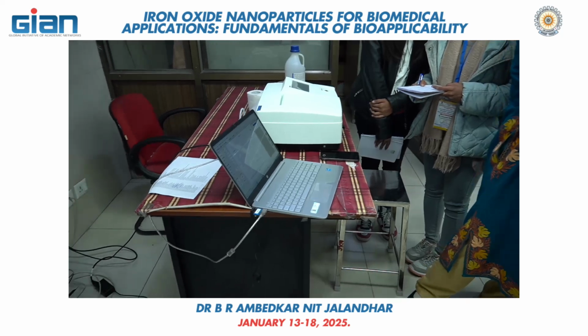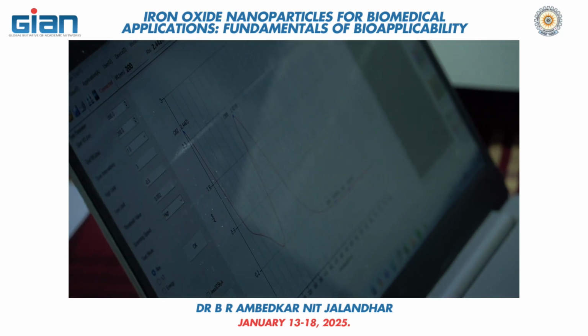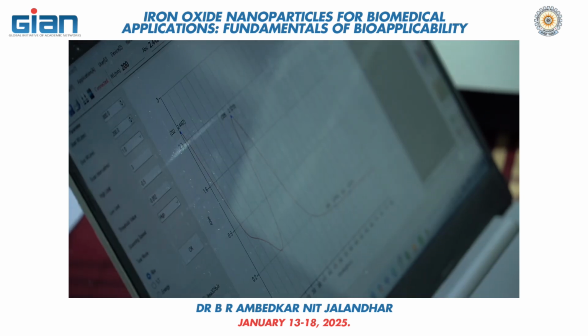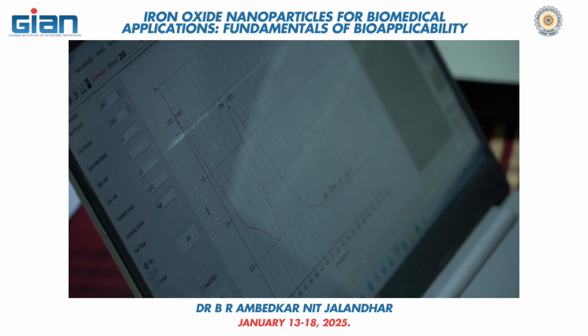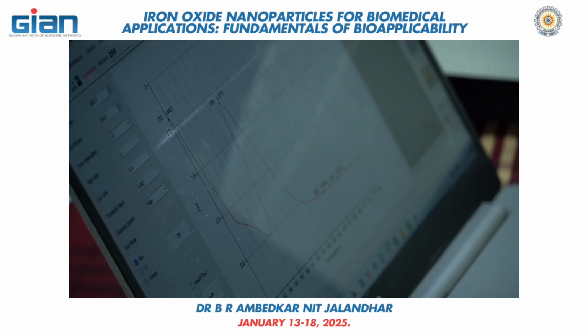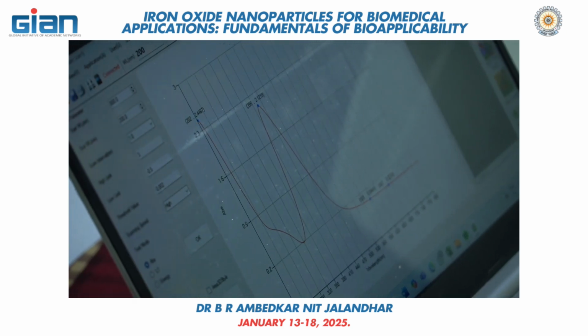So now you can see the UV plot. Hurry up, come here. So now this is the UV spectrophotometer. You can see this equipment. So we are adding the cuvette full of your sample. So cuvette is added of this silver nanoparticle. We have prepared this silver nanoparticle, yellow colored solution.